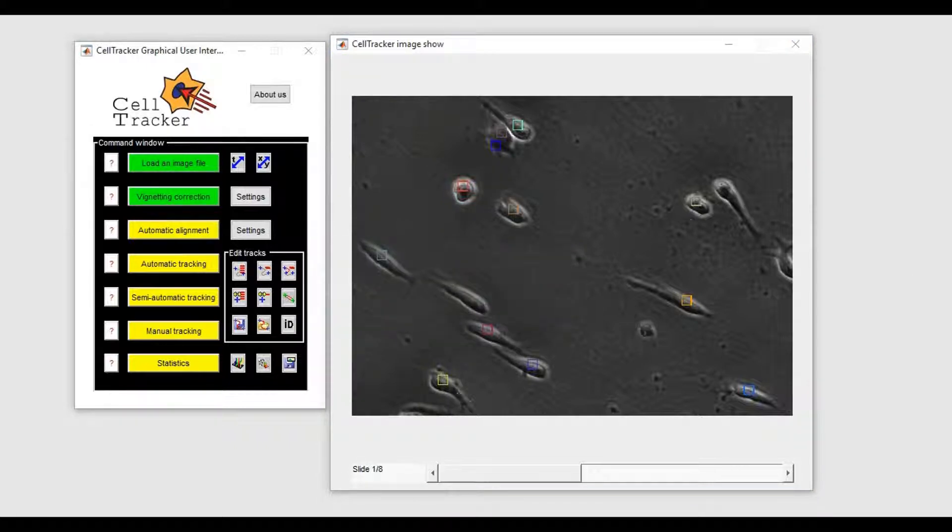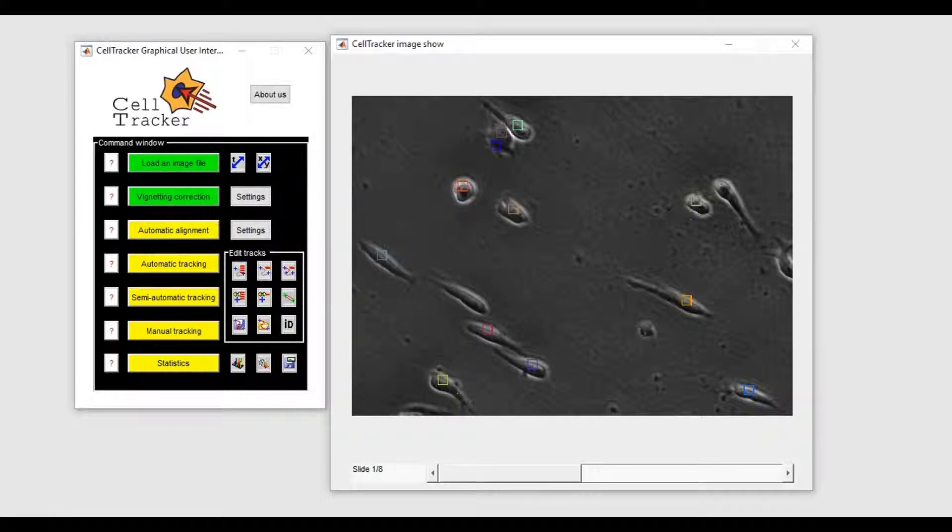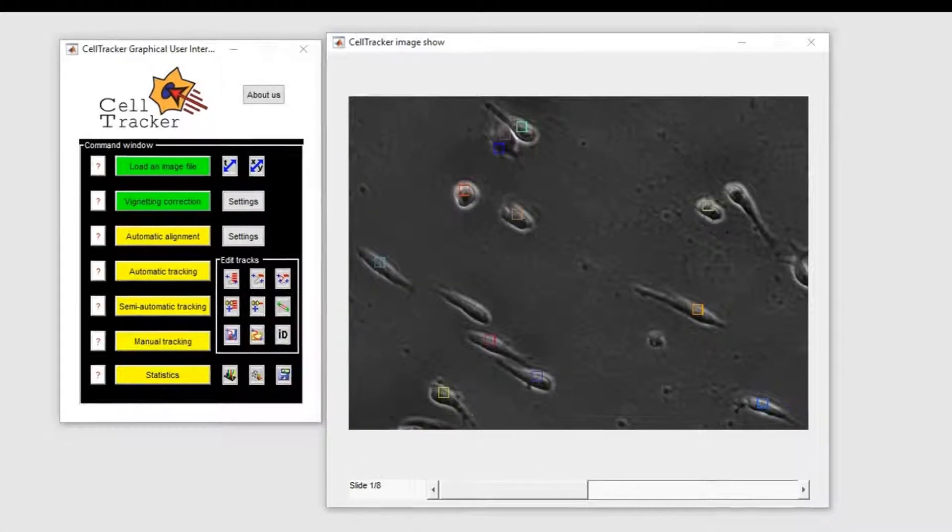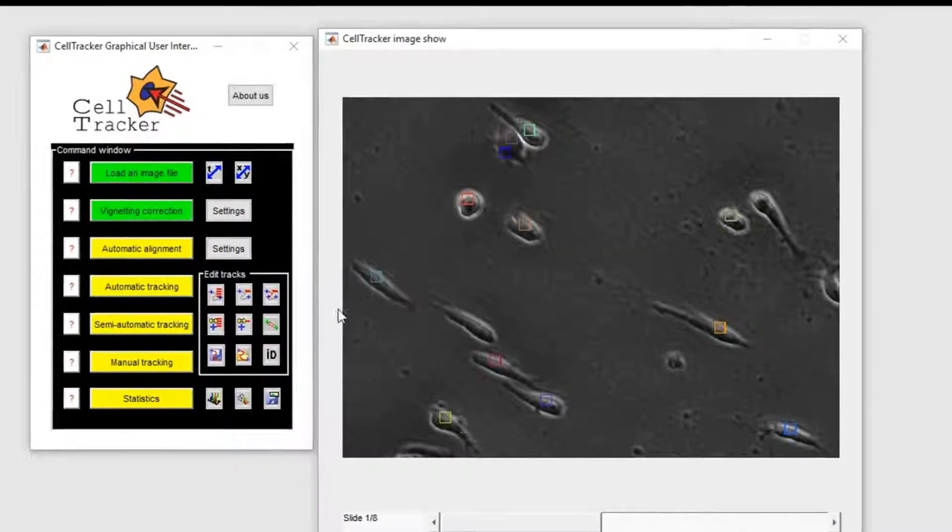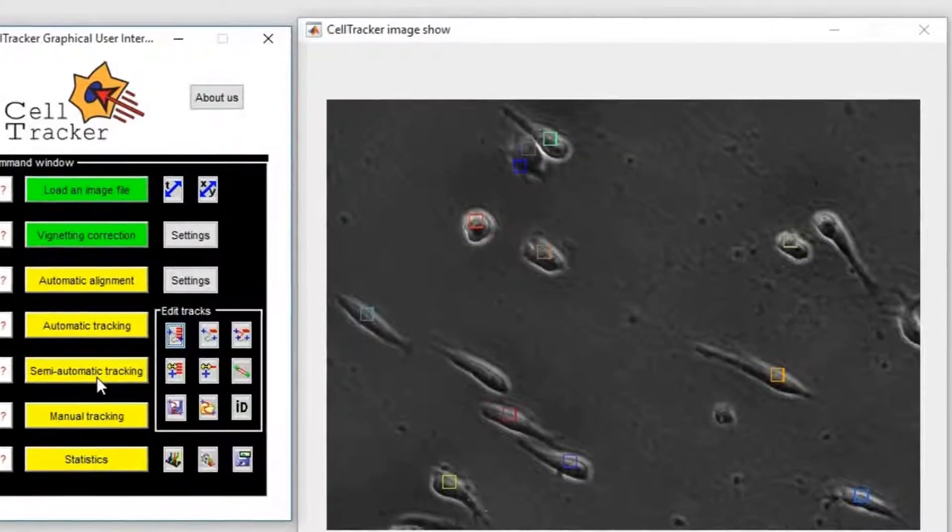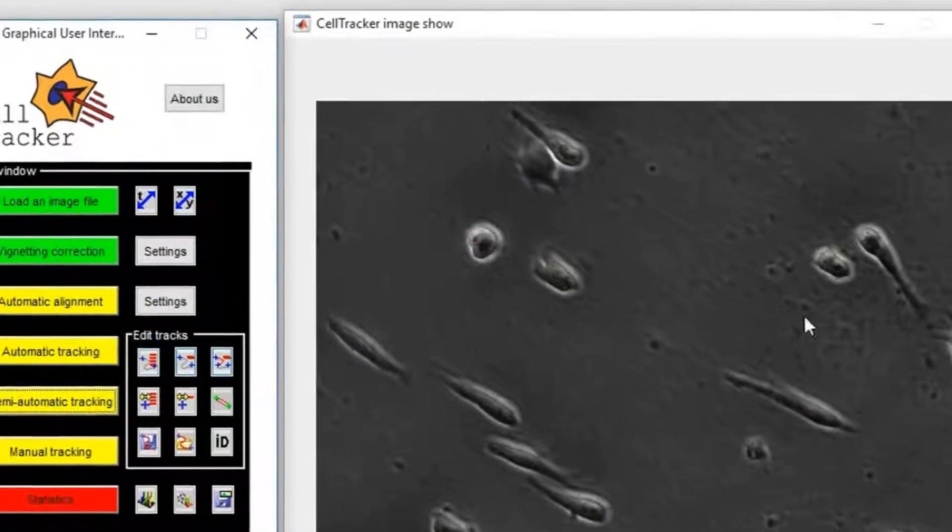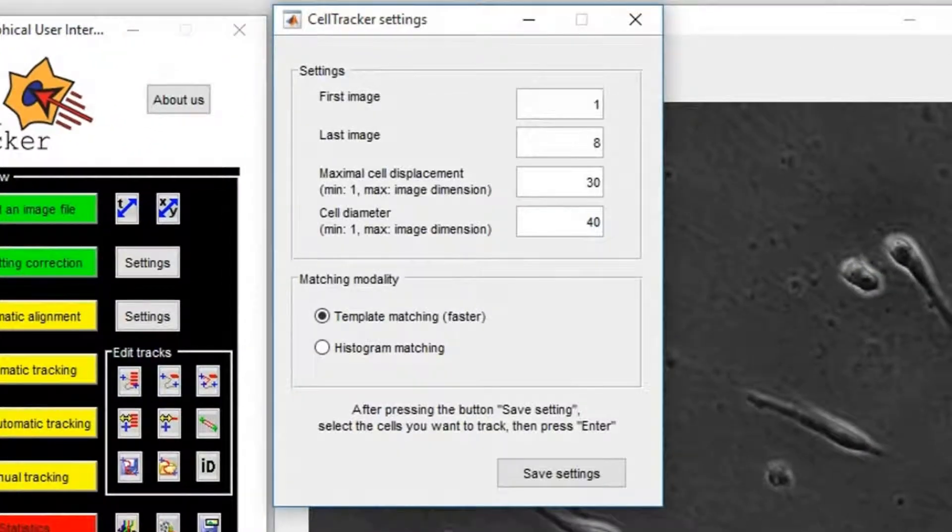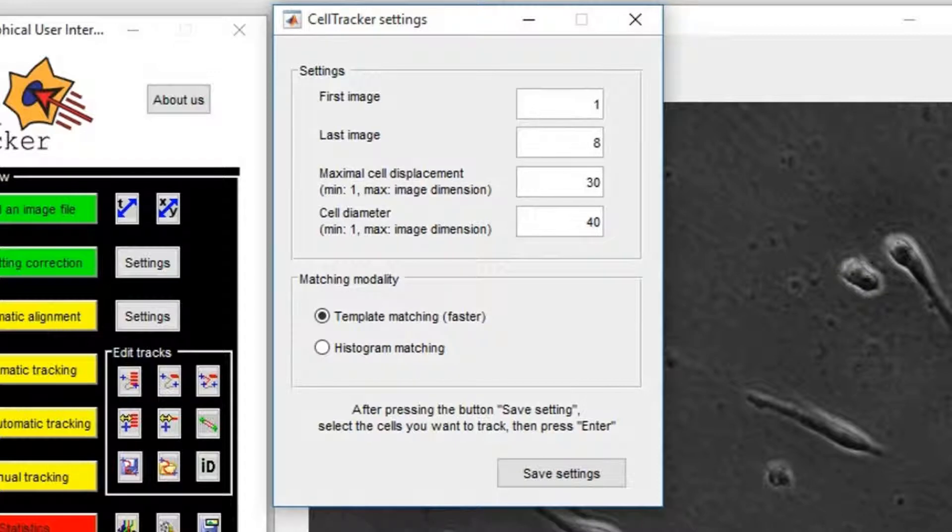To track the cells that are not detected automatically, we can proceed with the semi-automatic modality. In this modality, we have to select the cell we want to track. In this case, we also have to define the cell diameter.